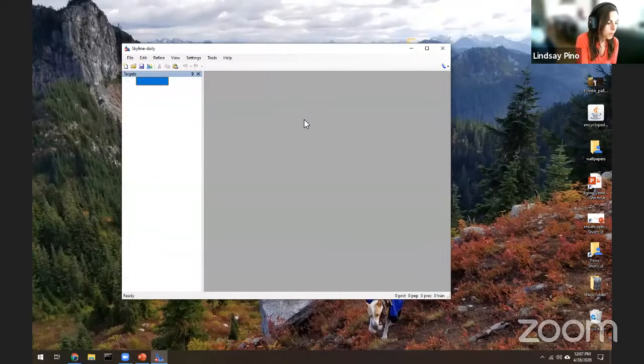So in the tutorial that I've sent out, kind of our practice scenario is that there are 6 proteins, clinically relevant proteins that we want to measure in plasma. And let's just say your boss has come up to you and said, here's your 6 protein targets, make me a mass spectrometry assay. Where would you start? So I've got 3 different scenarios for places you might start. The first place you might consider is just starting from nothing.